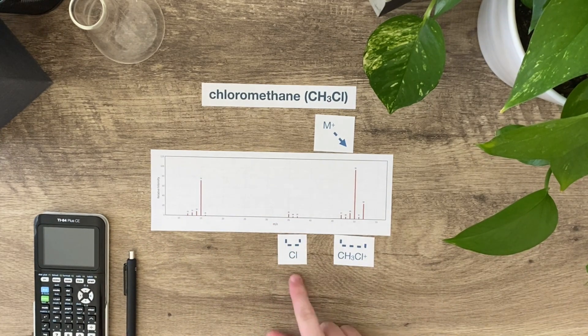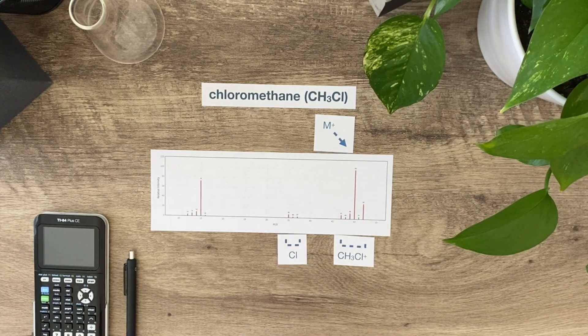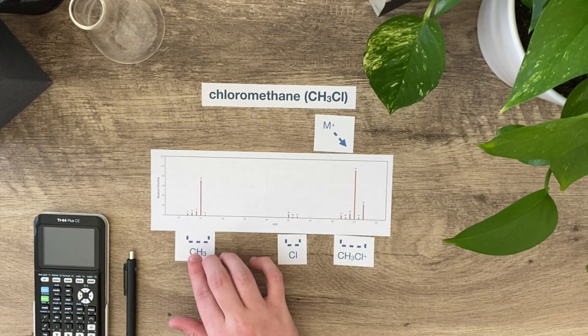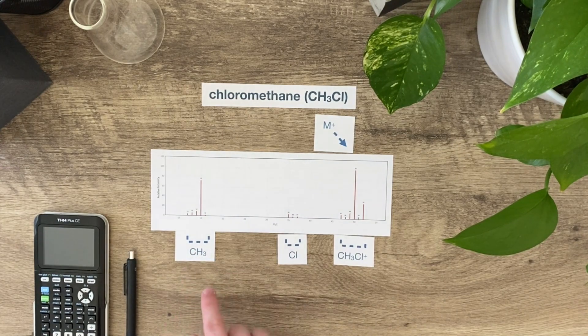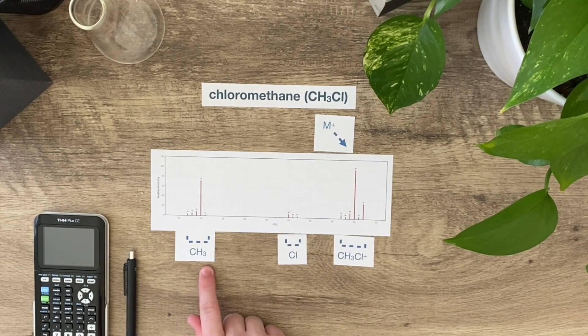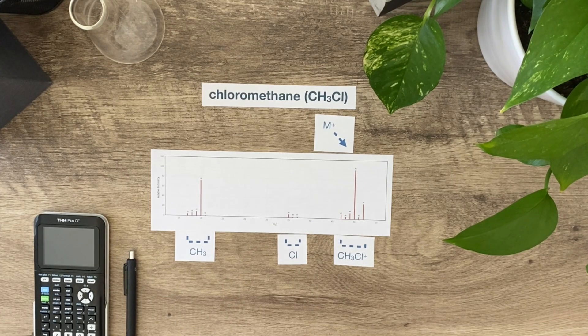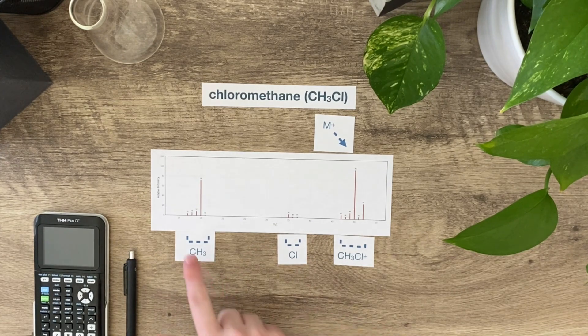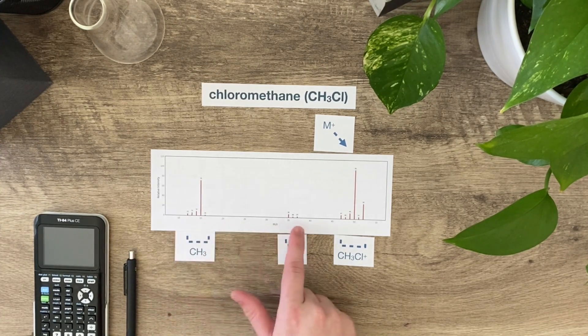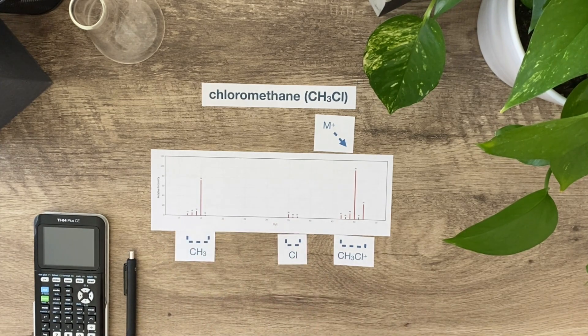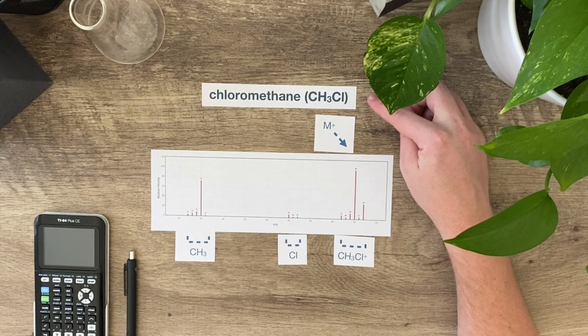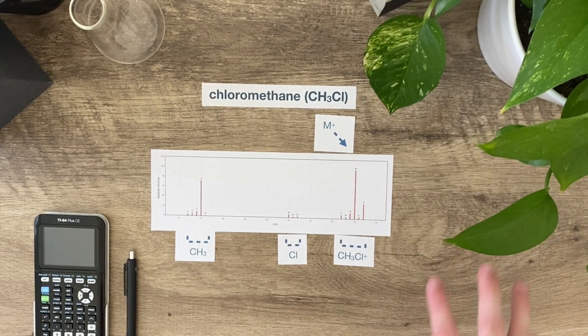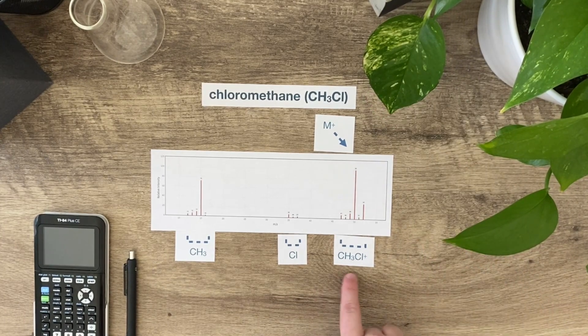When chlorine splits off by itself I get Cl over here. When CH3 splits off by itself I get this peak over here at 15, which makes sense because it's roughly 12 plus 3 for every hydrogen, so roughly about 15 assuming that the isotopes are the same. And of course, remember these other little peaks around them are just associated with other isotopes of those actual atoms.